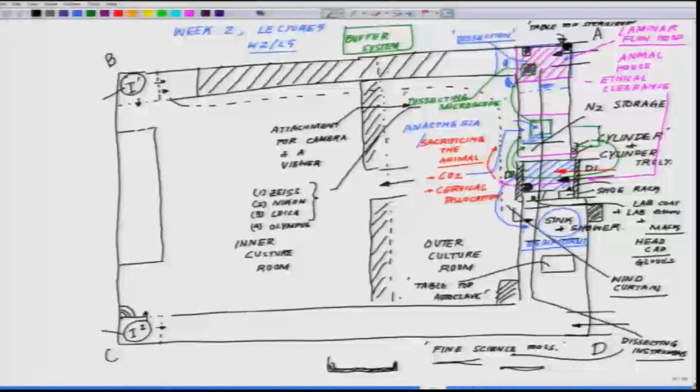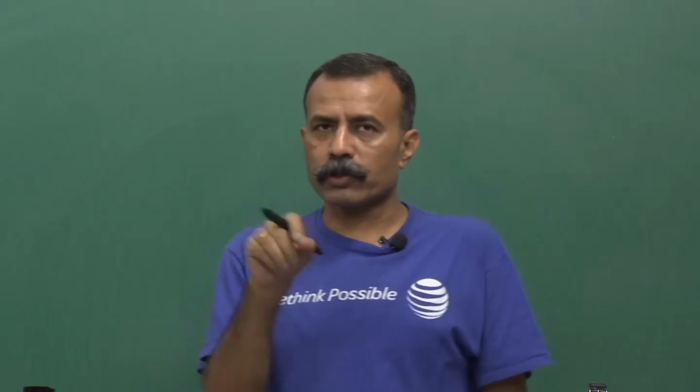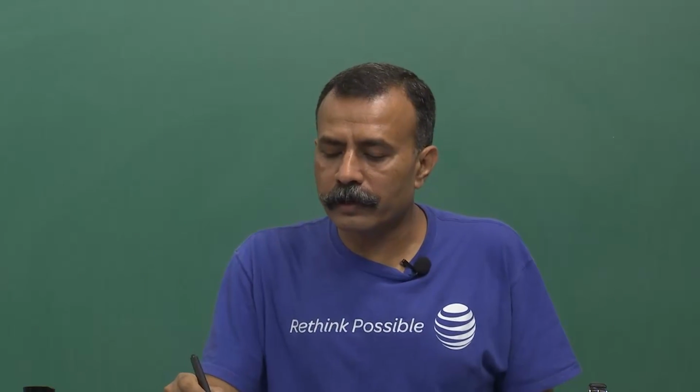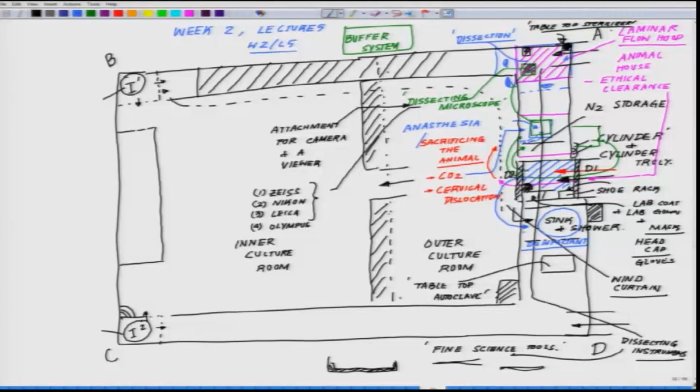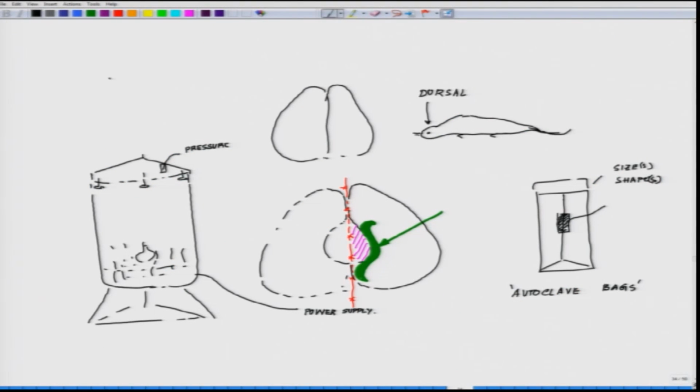So, you get these instruments inside, and while you are dissecting, you may feel like you want to re-sterilize, from one animal to the second animal, from one embryo to the next embryo. For that you need dry sterilization, which is the tabletop sterilizer. These sterilizers are small, about a quarter foot in size, and there are a lot of glass beads in them.